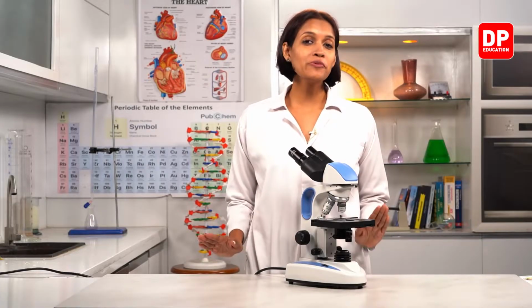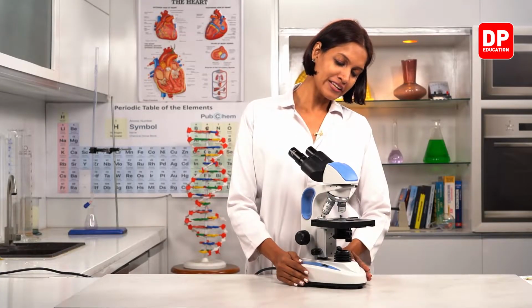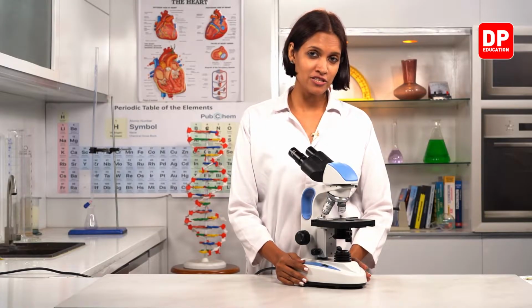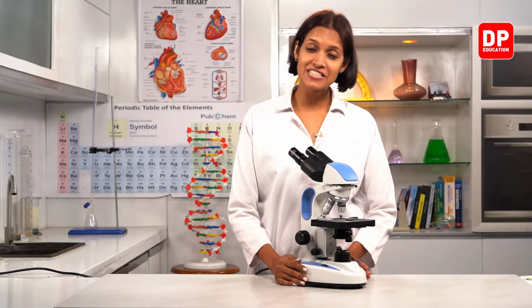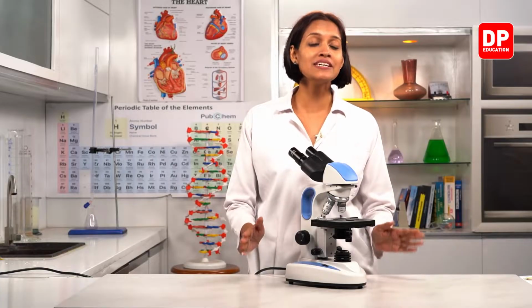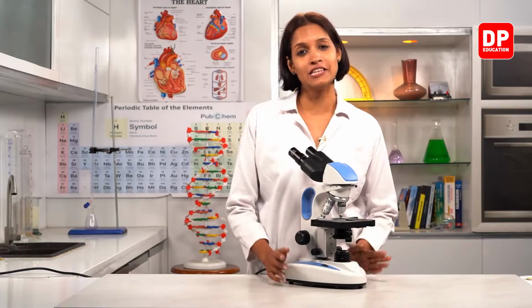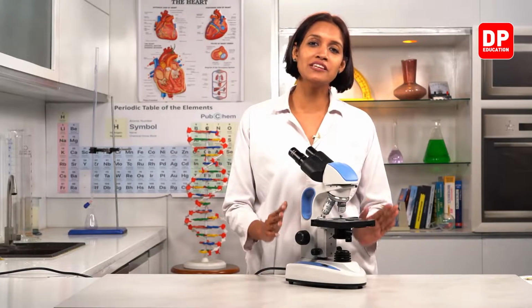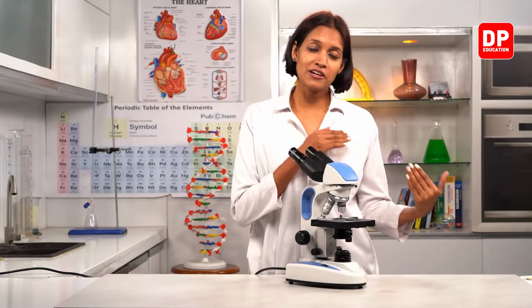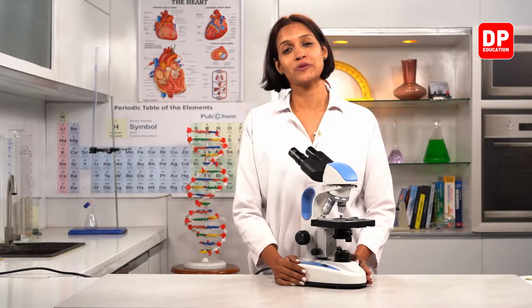Right, children. Now I'm going to show you all the parts of a compound light microscope. Look at this. This is the compound light microscope. But remember, this is a developed, modern compound light microscope. Most of our schools have the basic type, which is a bit different than this, right? I will show you the differences, but basically all the parts are there, similar to the basic compound light microscope, okay?